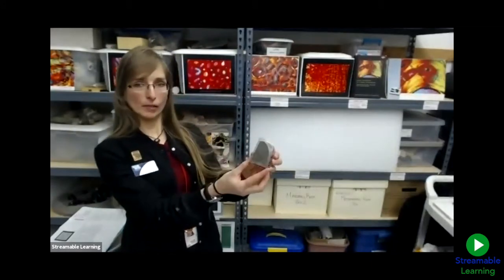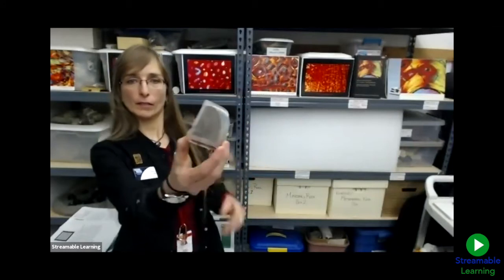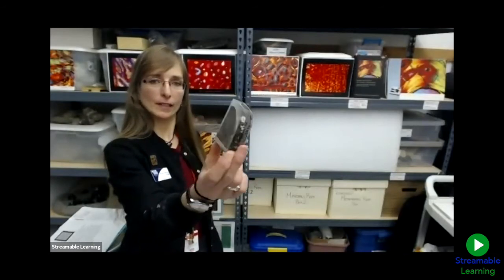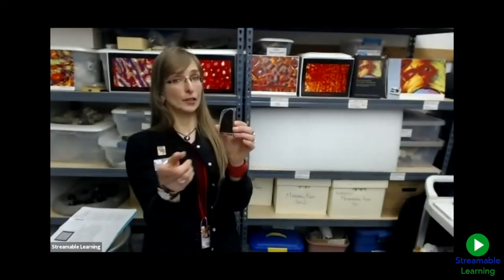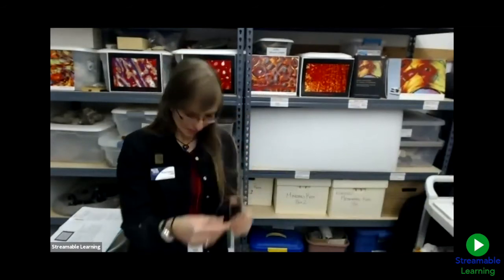Okay, now we're ready to begin making our thin section slides. So we'll take the actual fossil material and embed it in plastic resin. And that plastic resin is that clear area surrounding the fossil. That plastic resin enables us to cut a very thin slice of fossil material and have it stay intact. And later in today's presentation, you will see me thin sectioning a specimen on the saw.